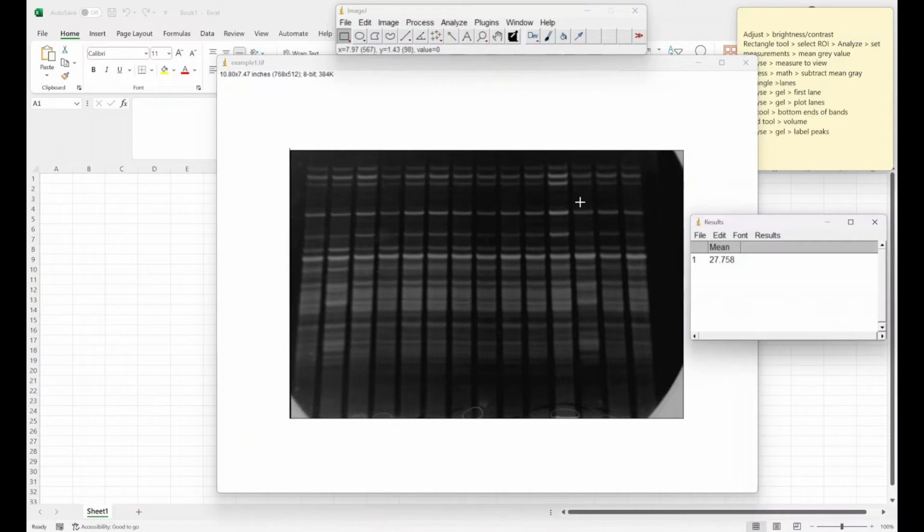All this does is a constant background subtraction from every pixel, but you can see down at the bottom here on the bottom left of the image, I would consider this area to be background, or certainly I don't want to measure these as bands because I don't think they are signal. But if I come across to the right, these areas which are still background are now darker than these areas. So if I use a constant value, do I use this one or do I use this one?